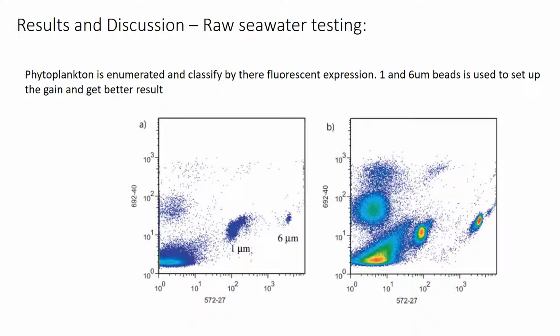However, I think it needs a lot of calibration or calculation which is used to relate the size of the respective area to the number of the particles or cells.